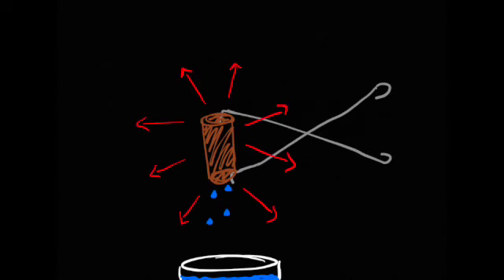One key uncertainty in this lab was the heat lost when the metal was taken out of the boiling water, dried off, and transferred to the calorimeter. Although the recorded initial temperature of the metal was the temperature of the boiling water, the actual initial temperature was lower because some of the metal's thermal energy was transferred from the metal to the surroundings during the transfer to the calorimeter. The change in temperature of the metal was then too high, and the determined specific heat capacity of the metal was too low.